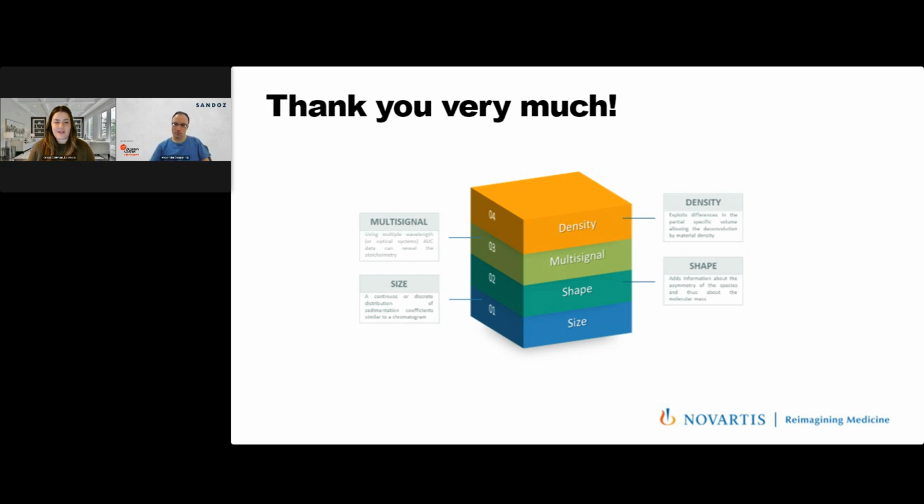Oh, that's great. Thank you. All right, our next question says, how do you handle the dynamic range of absorbances at different wavelengths when collecting multi-wavelength data? It is preferable to keep A230 in the ideal range while having lower ranges for 260 or 280.